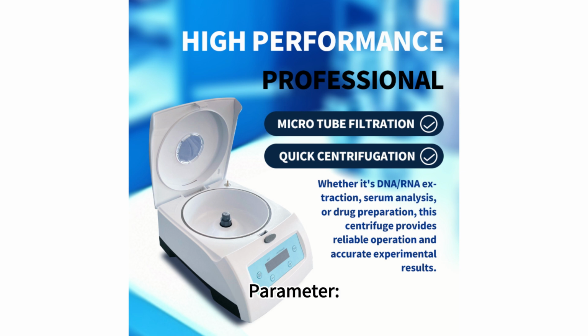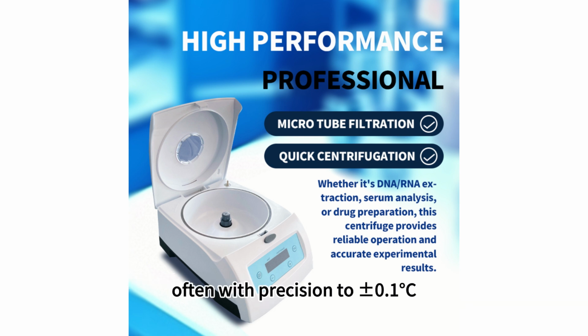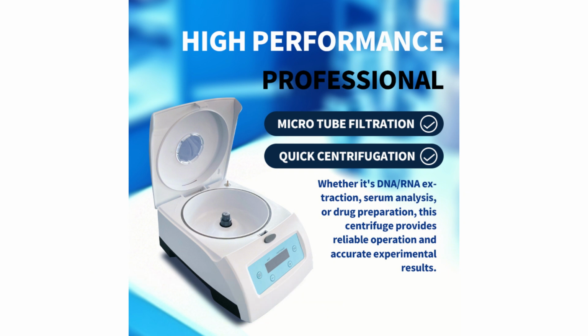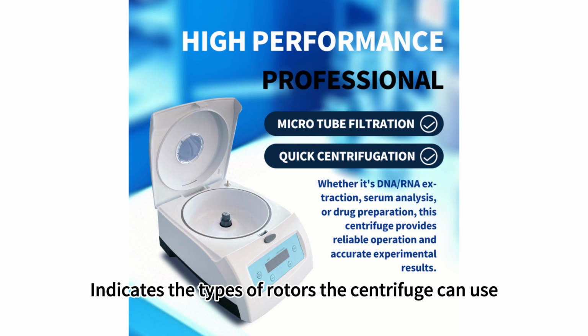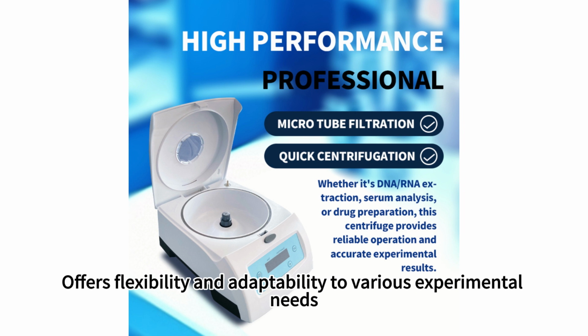Temperature control. Parameter: specifies the temperature range the centrifuge can maintain, often with precision to plus or minus 0.1 degrees C. Importance: critical for preserving sample integrity and preventing degradation. Rotor compatibility. Parameter: indicates the types of rotors the centrifuge can use, including fixed angle, swinging bucket, and zonal rotors. Importance: offers flexibility and adaptability to various experimental needs.